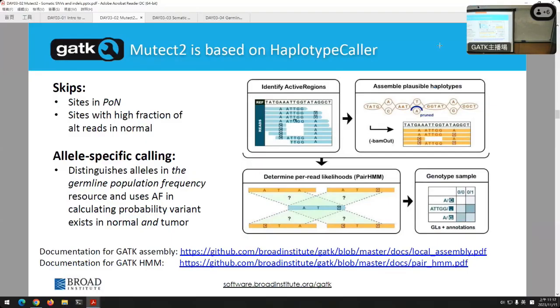Okay? Any questions there? The takeaway is that we're very strict in saying we think we see a variant in a tumor cell, but very permissive if we think we see it in the germline cells. And the idea is we don't want to accidentally say, oh yeah, that's definitely a tumor variant, when it's really not.